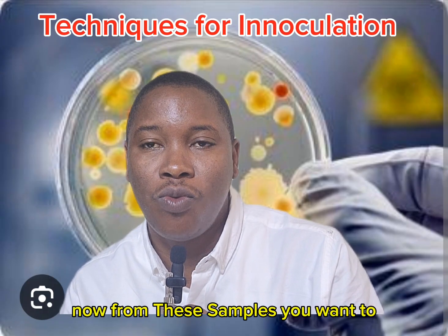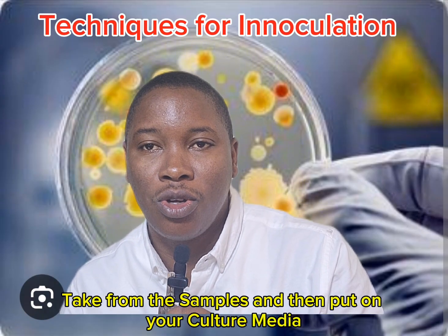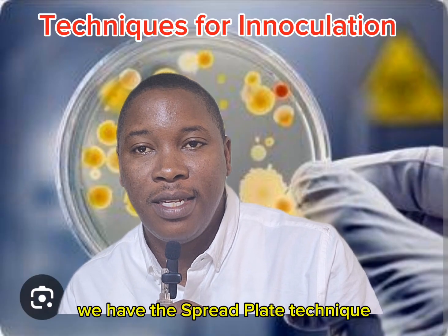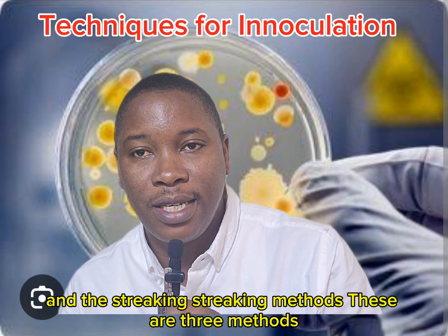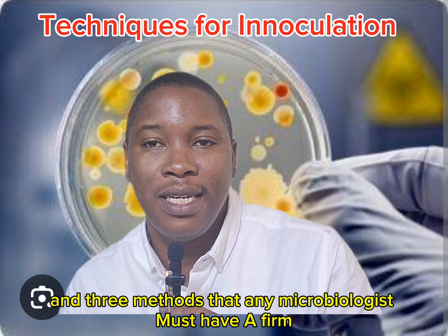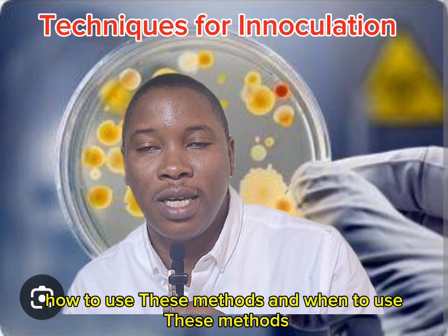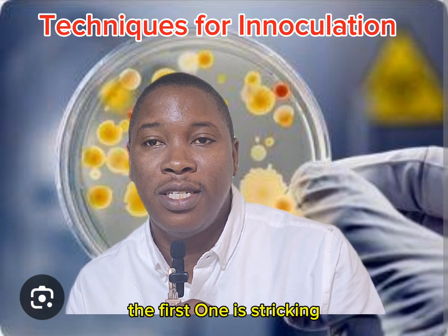Now, from these samples, you want to take from the samples and then put on your culture media so that you can grow out your microorganisms. Basically, there are three techniques that we use. We have the spread plate technique, the pour plate technique, and the streaking method. These are three methods that any microbiologist must have a firm grasp of. You must understand what these methods are, how to use them, and when to use them. Very quickly, we'll go through these three methods. The first one is streaking.